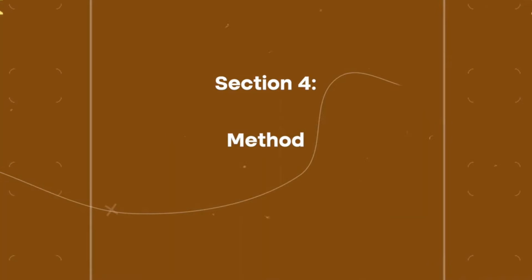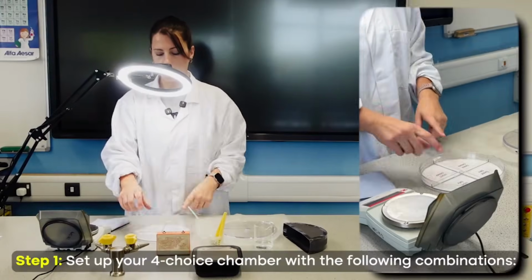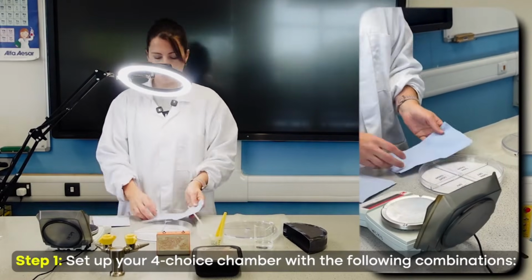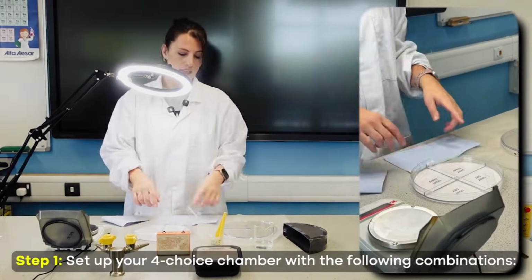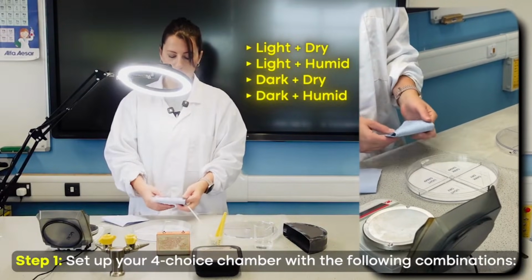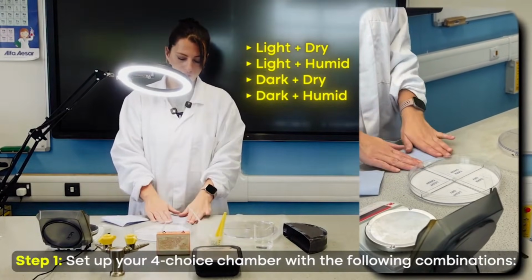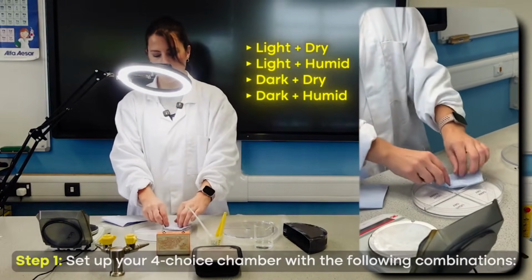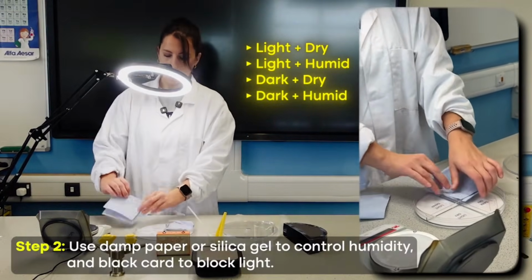So we need to set up our 4 chambers to start. We've got light, we've got dark, and we've got the damp sections. So I'm going to get one piece of paper towel to go into both of those damp sections, and we need to be adding the same amount of water. So these are the things to consider for the control variables. So I'm just going to fold it so that it can fit. So I've got one piece of paper towel in there.